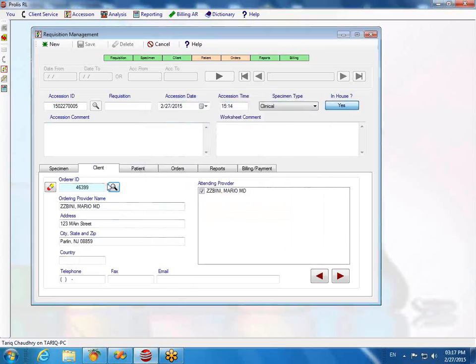If it is a group practice or a hospital or a nursing home or a dialysis center, then this portion is going to display the name and the address of the hospital, and this portion is going to display the individual doctors working within this entity. Okay, so how do we set that up? This is set up in the client management area. All the doctors are created first, individual doctors, and they are associated with entities like this. So there's a separate feature for creation of organizations and then the individual doctors. Absolutely, yes. All right, good.